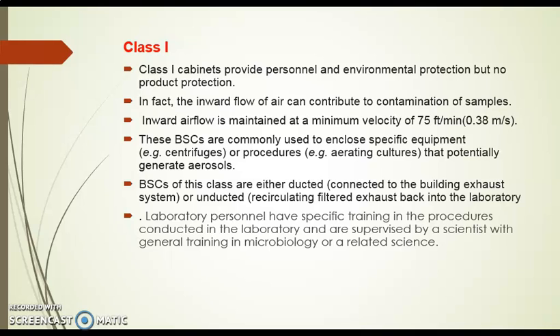The BSCs of this class are either ducted, which have been connected to the building exhaust system, or unducted, recirculating filtered exhaust back into the laboratory. So it can be either ducted or unducted. Laboratory personnel have specific training in the procedures conducted in the laboratory and are supervised by a scientist with general training in microbiology or a related science.